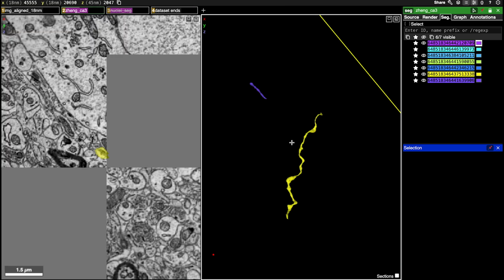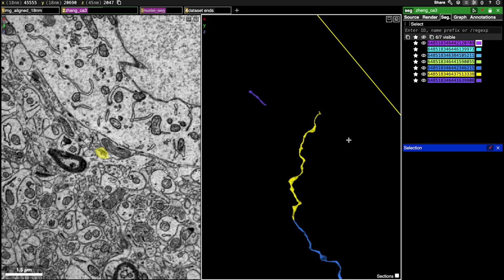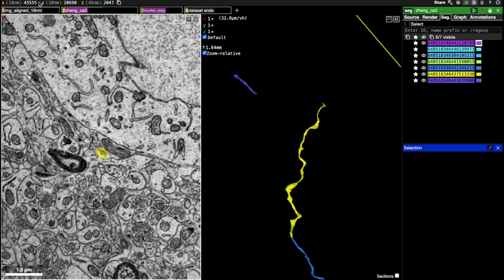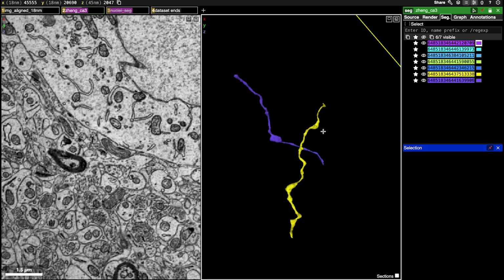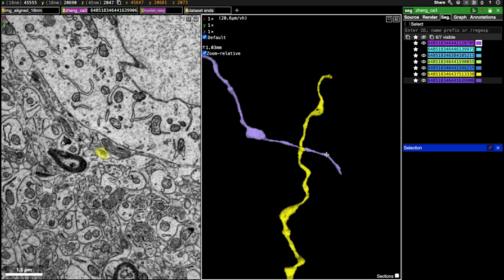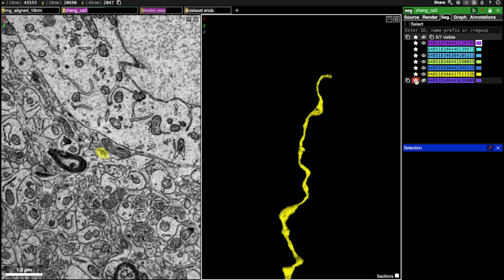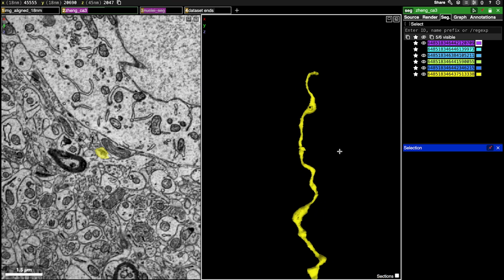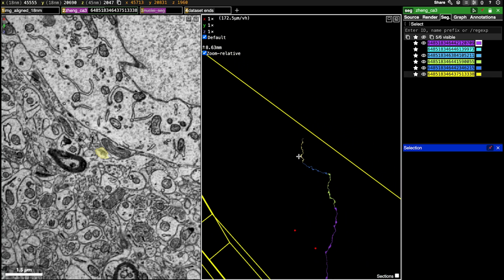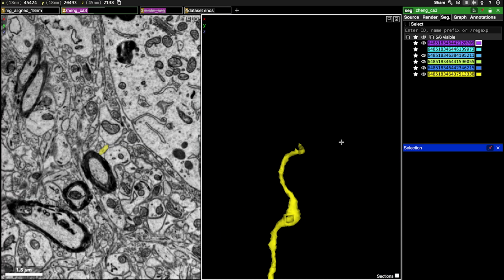I'm gonna try and refresh and see if that'll speed up making the segment appear. It just seems to be taking its time refreshing. Okay, there it goes. Okay, so you can see this is all one segment now, and that was the merger segment. So I'm just going to double click to delete that. And I'm actually going to remove that from our list up here as well, because we don't need to pay attention to that one anymore. Okay, and I'm going to keep going.